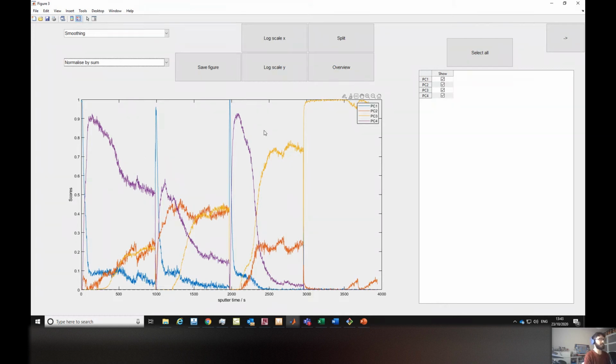So this is a much more complex data set than the previous one. All these changes could be because of just the morphology, or it could be actual chemical changes. So let's say if I added a 5th component here, maybe only the center of the worm would have this because it's related to the biology of it, some chemistry that's only present there.